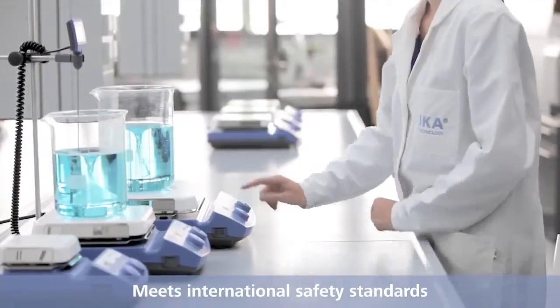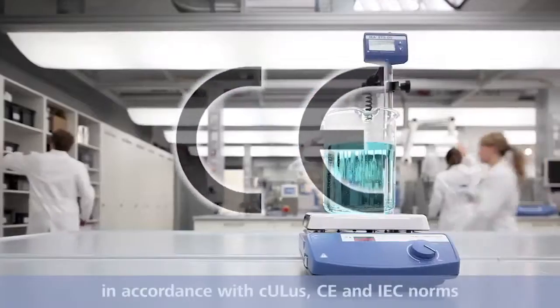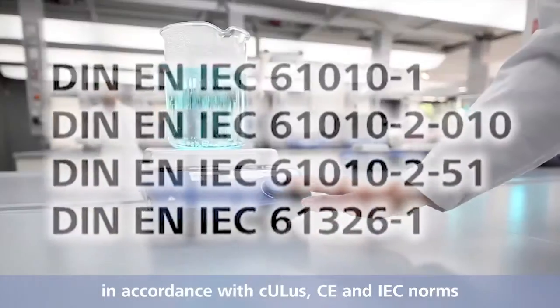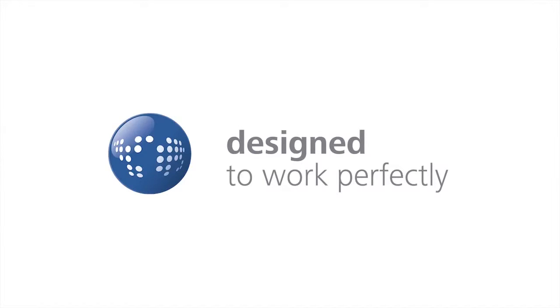The devices of the IKA C-MAX series meet international safety standards. They are in compliance with UL, CE, and IEC norms. IKA. Designed to work perfectly.